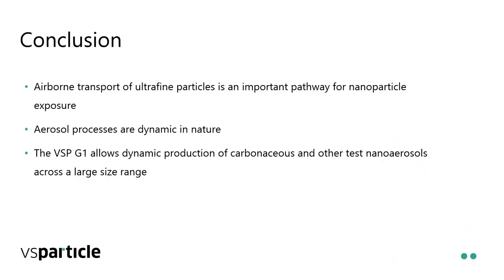So to conclude, the main take home here is airborne transport is important if you want to know where ultrafine particles end up. Aerosol processes are dynamic in their nature, so you need to take your whole system into account. It's not just, hey, I make an aerosol with a certain particle size and concentration and I'm done. No, because you still need to get that aerosol to where it needs to go.